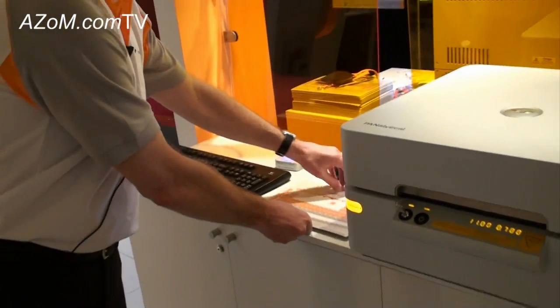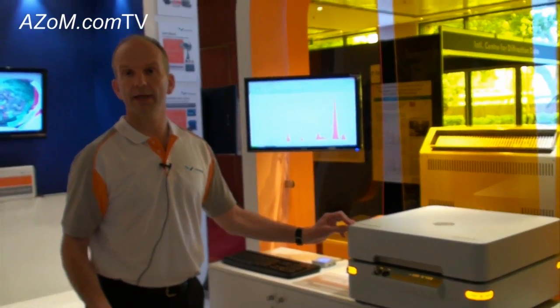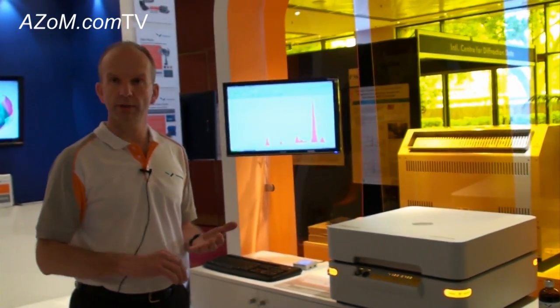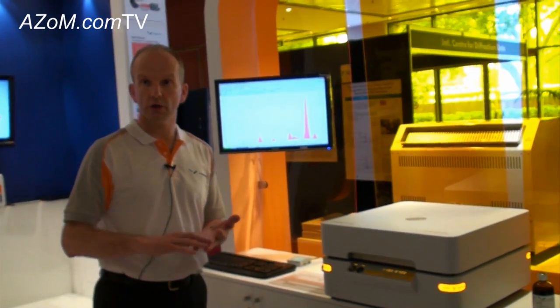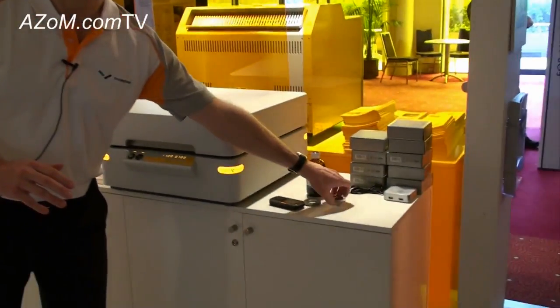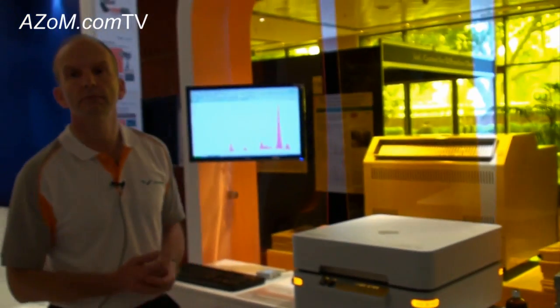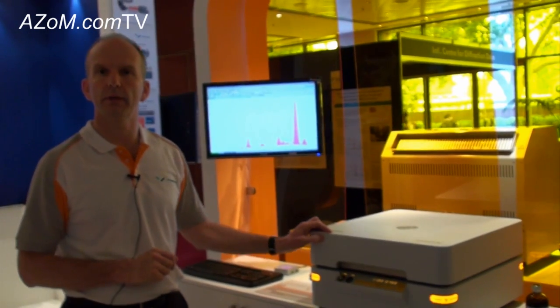Who typically uses this type of instrument? What's your target market? It's basically what we would call a can-do-all instrument, so it's relevant for many different types of industries — principally cement, certain mining applications, soil and contaminated land type applications, applications in the petrochemical industry like sulphur in oil or wear metals in oil, or perhaps polymers and plastics. Here we have a piece of plastic. So is it more suited to quality control type applications rather than high-end research? Yes, it's definitely more of a production control type instrument.